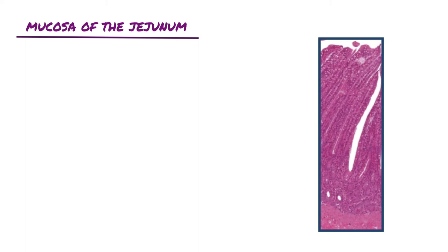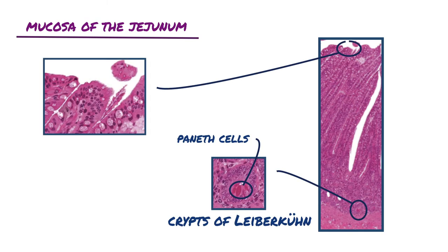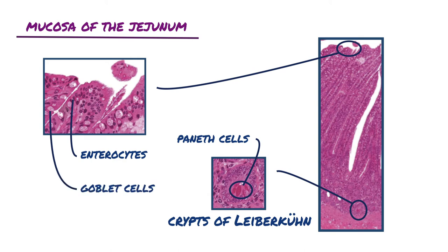Looking at a section of the jejunum, we can see that the mucosa shares the same characteristics as the duodenum's mucosa, including the crypts of Lieberkühn, Paneth cells, enterocytes with their microvilli, goblet cells, lamina propria, and muscularis mucosa.